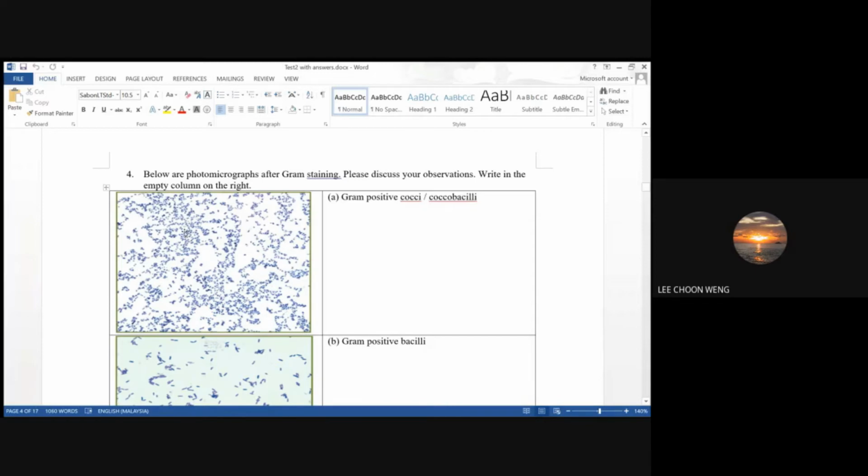You take from the edge or take from the center? For spore staining, where do you think you'll get the best staining results? From the center of the CFU colony or from the edge? Spore staining is better for old cells. So where are the old cells? Center or the edge? In the center, yeah.